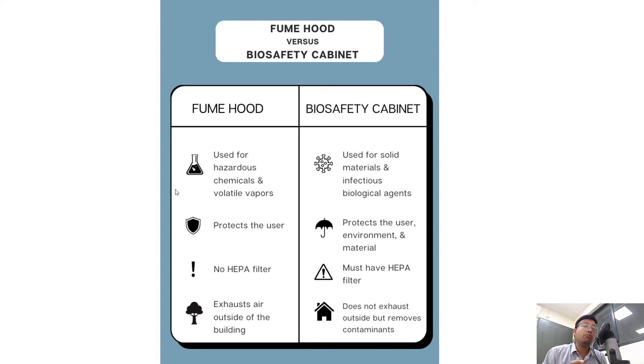Fume hoods have an exhaust to the outside of the building. But in the case of a biosafety cabinet, the exhaust doesn't simply release into the environment — there is a specialized mechanism to contain the biohazardous materials. It siphons out harmful toxic fumes and all biohazardous material and removes them totally from the environment, so there is no exposure to either the person doing the experiment or anyone standing near the laboratory exhaust.